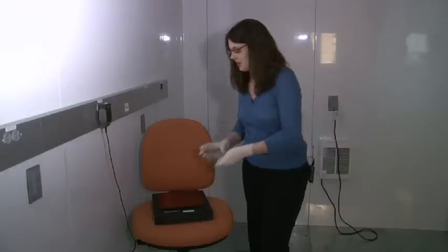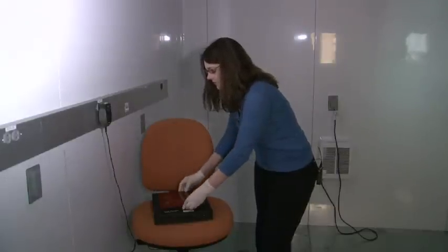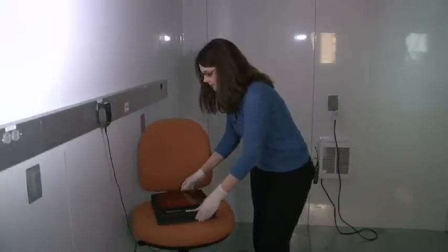So here we are in the darkroom, and I've got my gel. I put my gel into this light box right here, and then I simply turn on the light, and all of the bands of DNA appear. So here you can see the results of the gel.